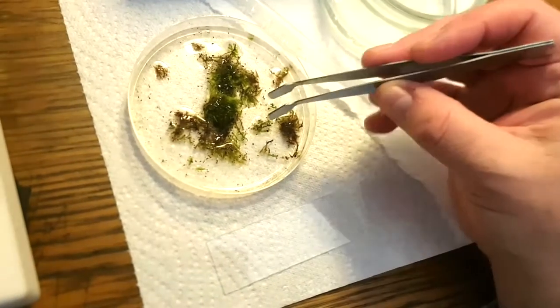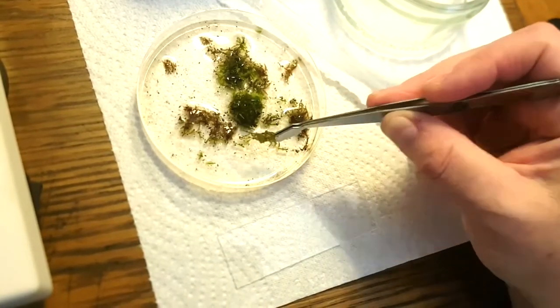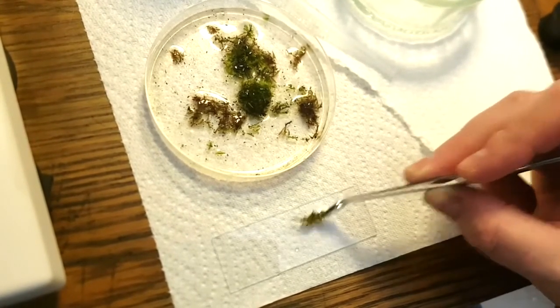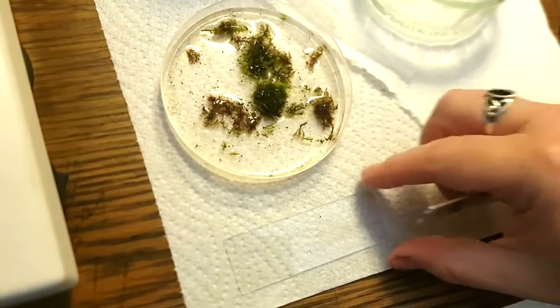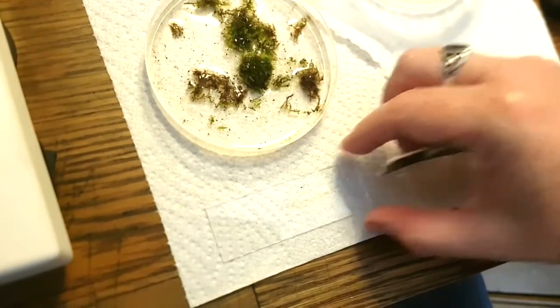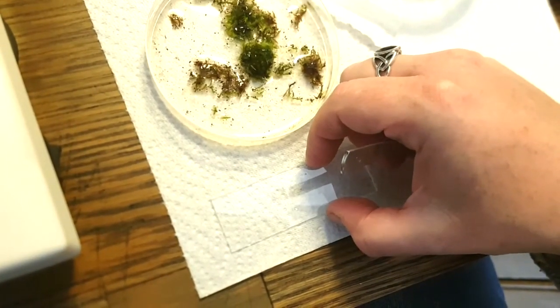But basically, the last video of his that I saw, he was tapping bits of moss onto the microscope slide. So that way it deposits some of the water and some of the sample. And if there is anything stuck to that moss or crawling around on it, you can see that it's very, very hard to see, but there is a puddle of water there now. So anything that might have been nestled within that moss is now on the microscope slide rather than crawling around the moss.